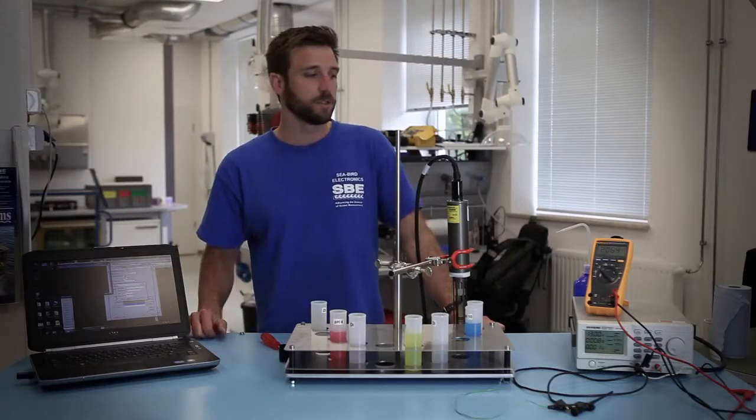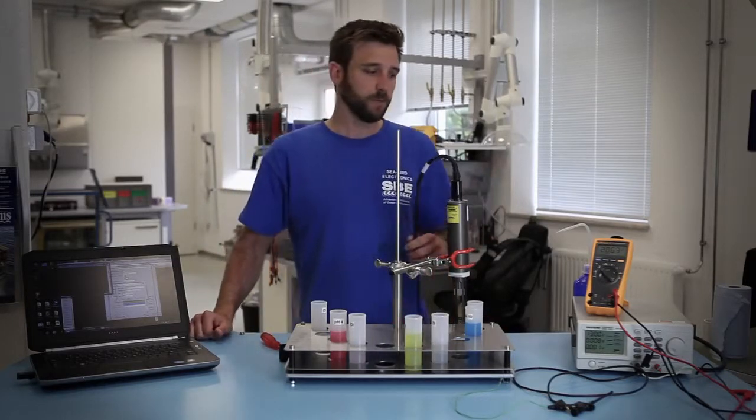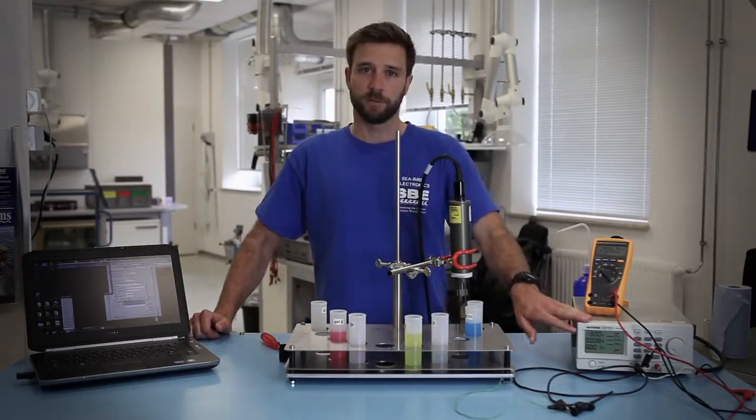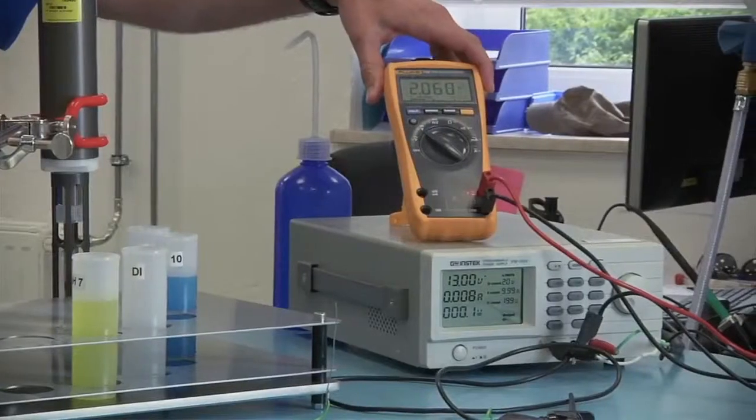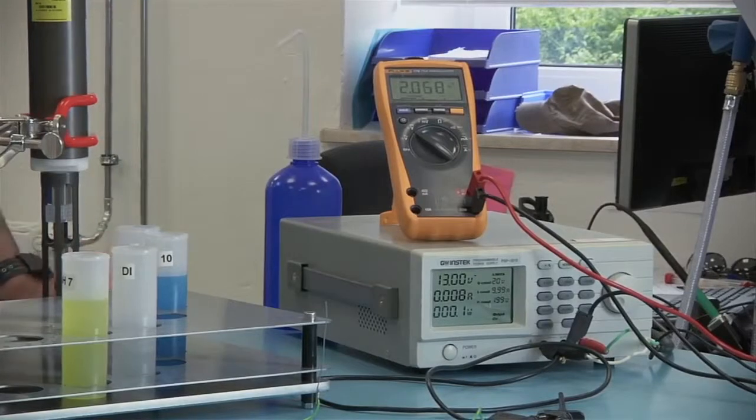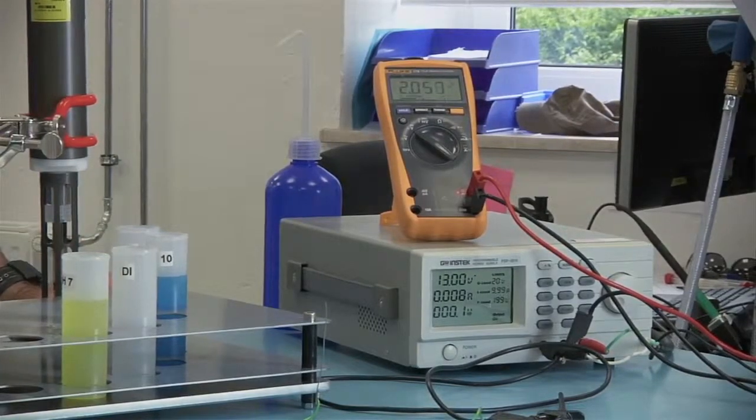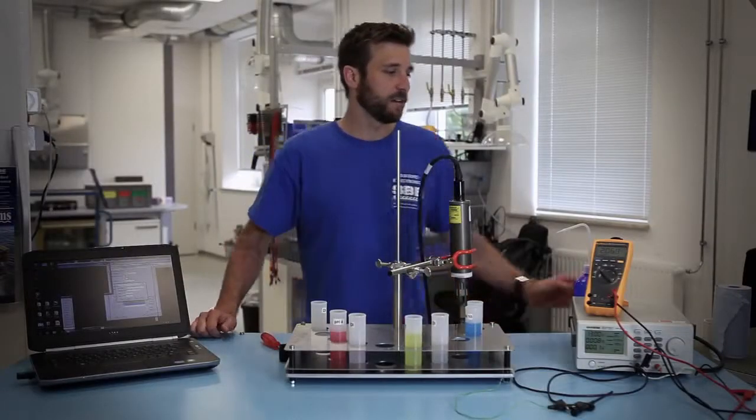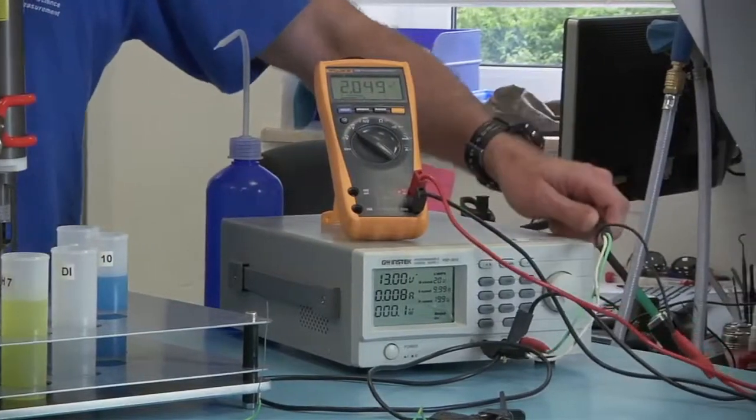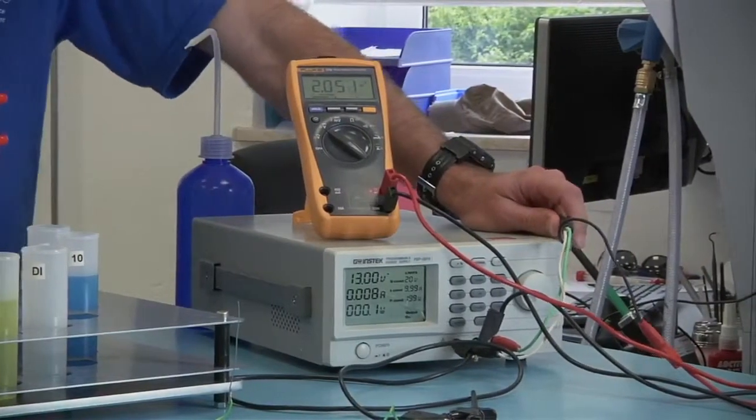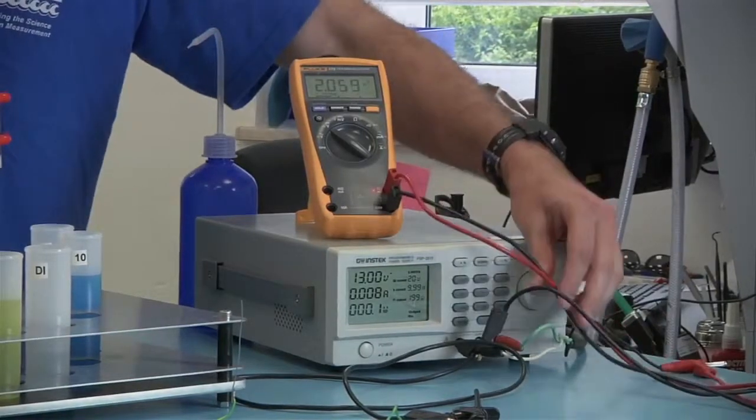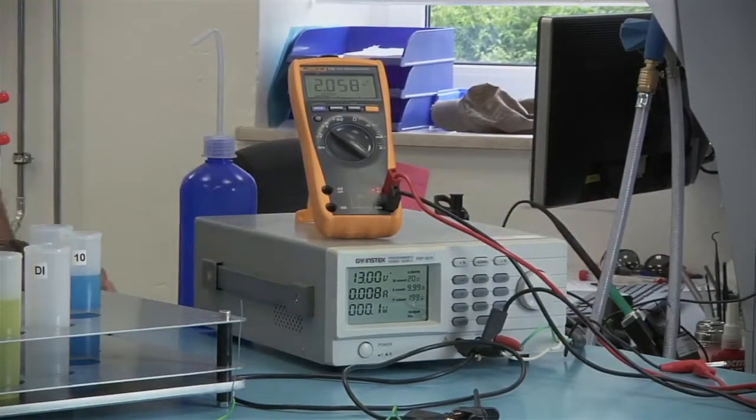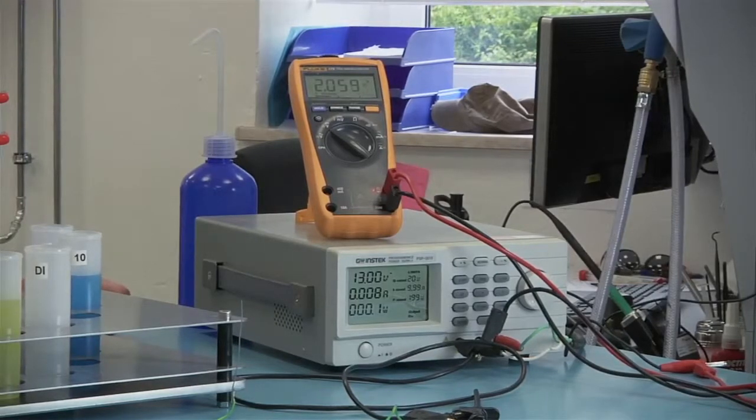When you're calibrating the sensor you'll need to provide power to it. Here we're just using a power supply. You also need a digital multimeter so you can record the voltage output by the pH sensor. In this particular setup we have a cable that attaches to the pH sensor and then into the power supply. And then we have the multimeter in line with the power supply to record the voltage from the pH sensor.